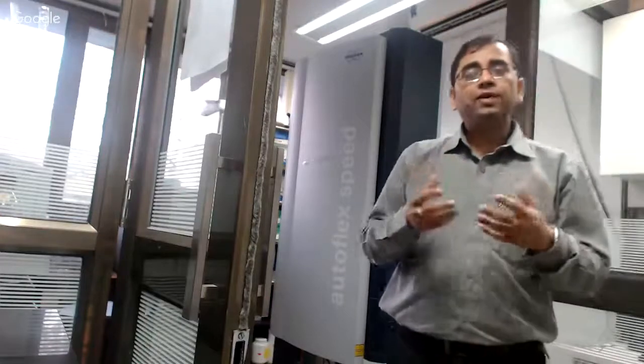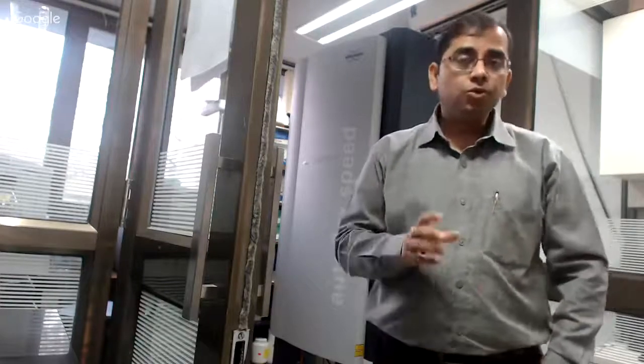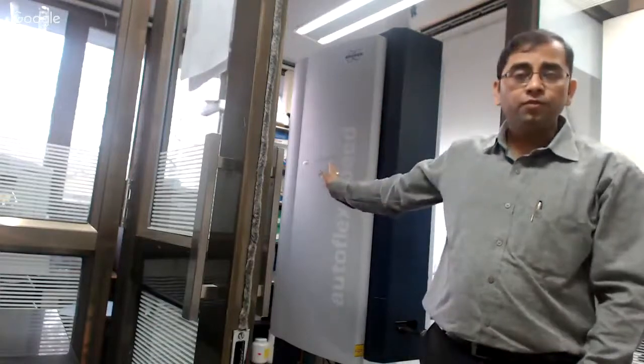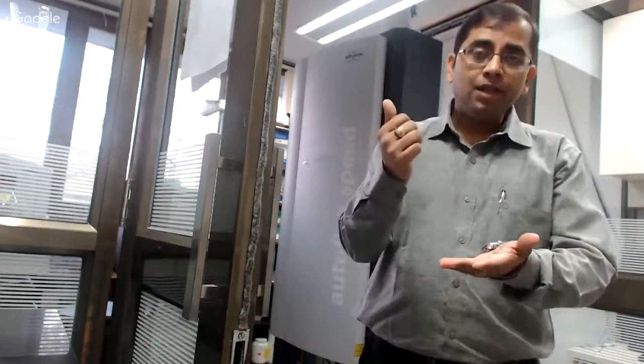So I really want to involve you in some sort of discussion and gauge the interest to find out the pros and cons of different types of instrument platforms and technologies. Of course, each day we cannot cover every technology, but today our intention is to talk to you about one of the instruments here, which is Maldi TOF. We have planned a little bit of theoretical part, some basics which we are going to cover. Along with that, we're also going to show you some hands-on: how to take the plate and put the matrix and samples, how to prepare the plate properly, and then how to insert the plate and analyze using the specialized software we have within Maldi TOF Master.